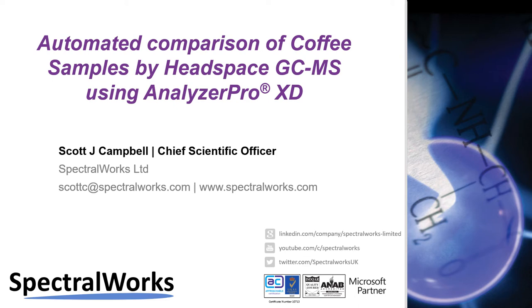In this presentation, we are going to look at how Analyzer Pro XD was used to automate the comparison of coffee beans to objectively see if there was a measurable difference between coffee samples from multiple geographical locations.